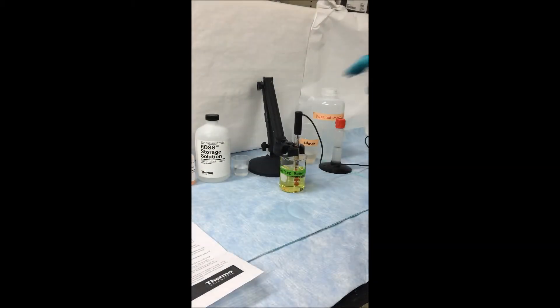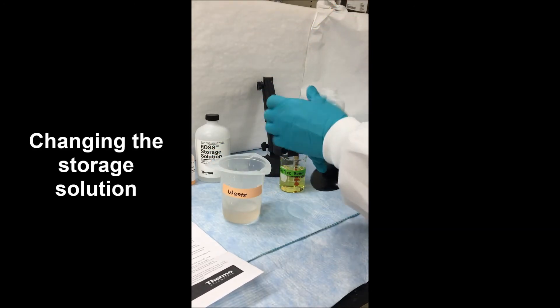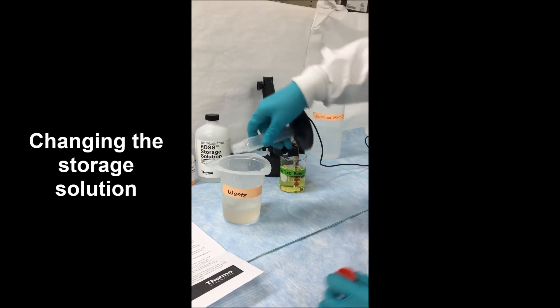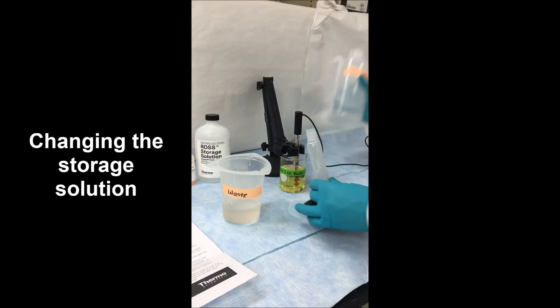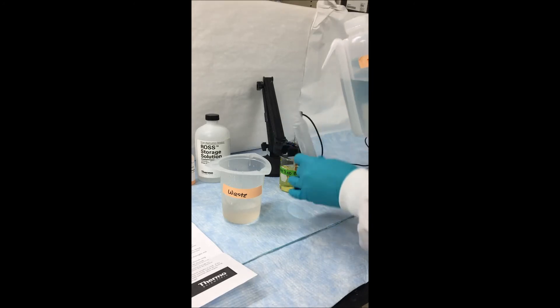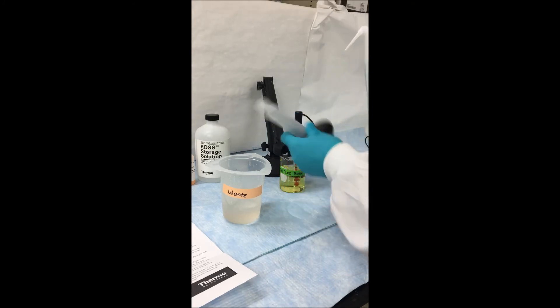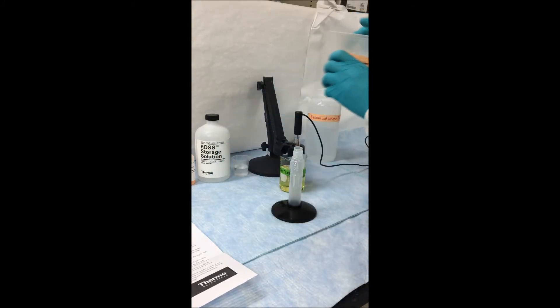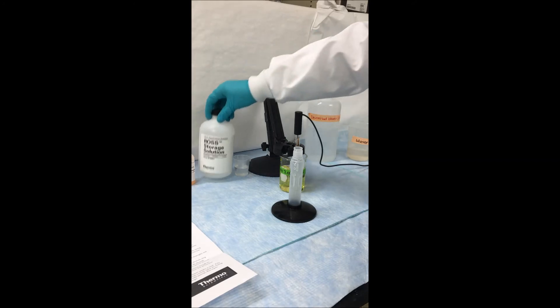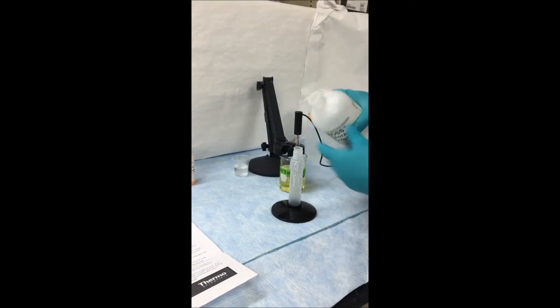While waiting for that electrode to rehydrate, it's a good idea to change your storage solution. Go ahead and dump out that old storage solution and rinse out your storage container thoroughly. You want to try to change your storage solution at least once every two weeks to make sure that there's no buildup and no contamination of your electrode. Choosing the appropriate storage solution for your electrode, make sure that you fill your storage container enough so that the entire bulb and junction of your electrode are always submerged under storage solution.